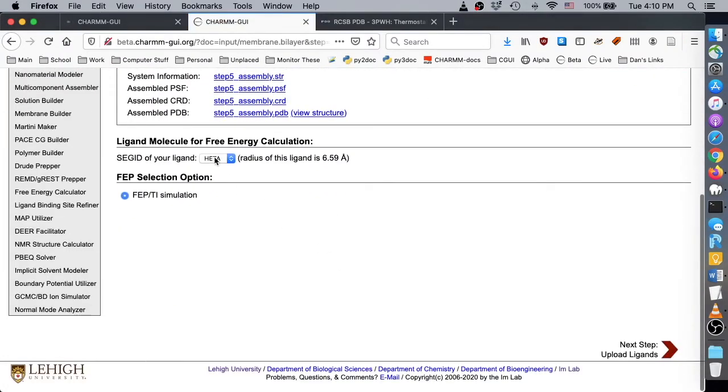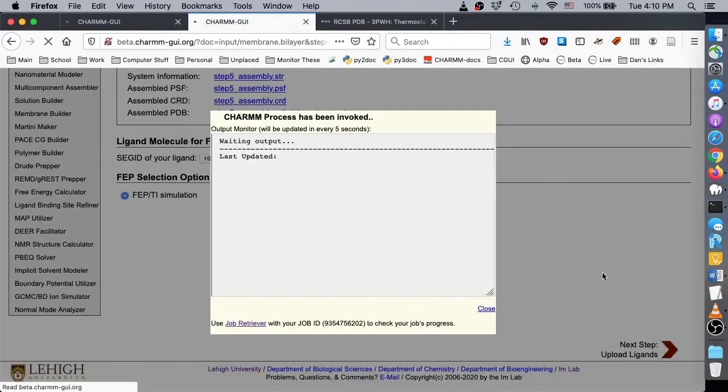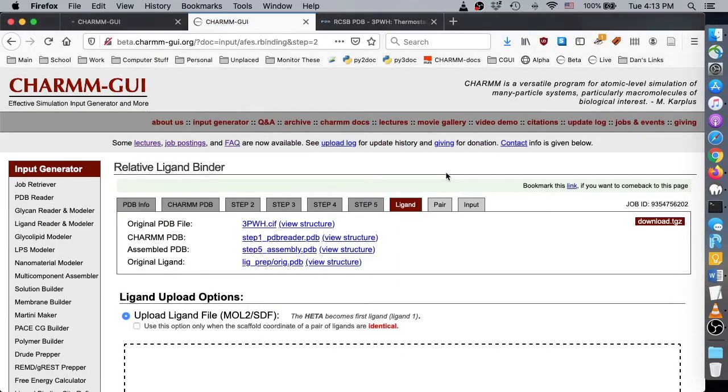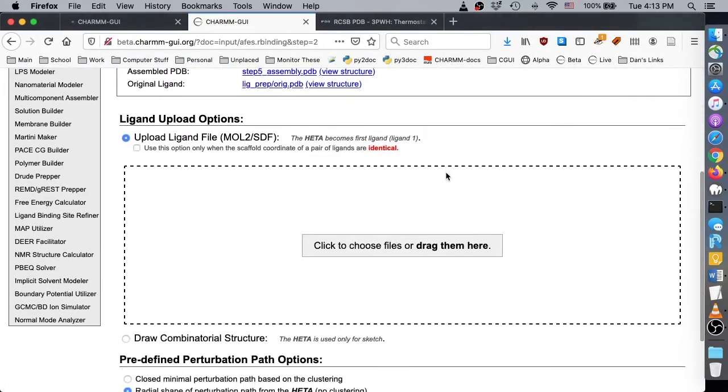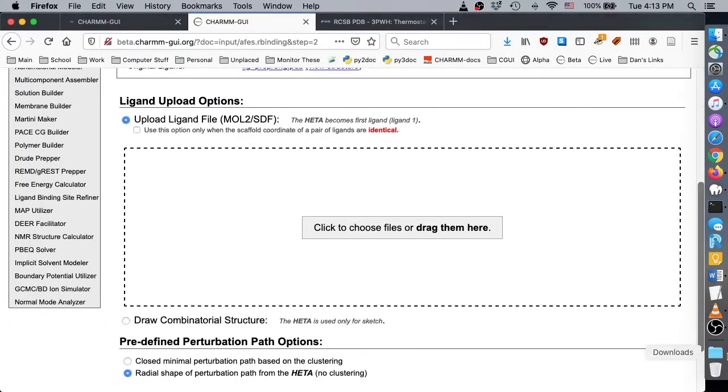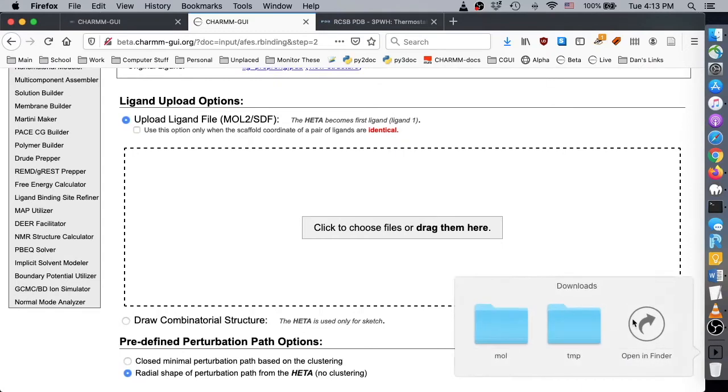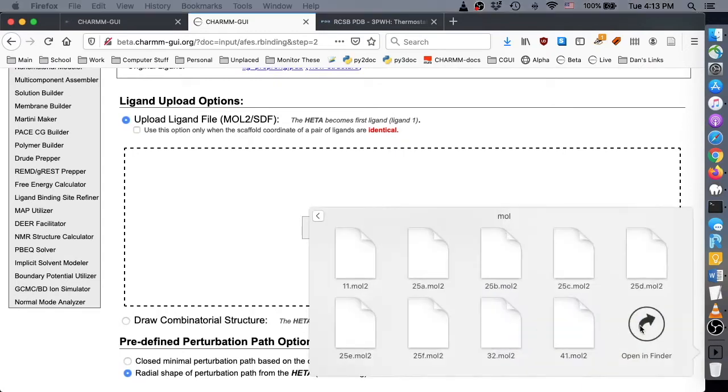When membrane assembly is complete, we begin the ligand binding steps. On this page, we upload the same three undocked multi-ligand files as in the previous video demo.